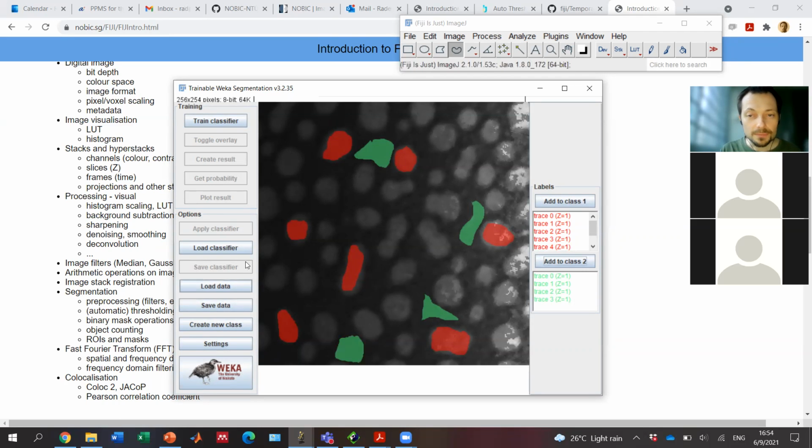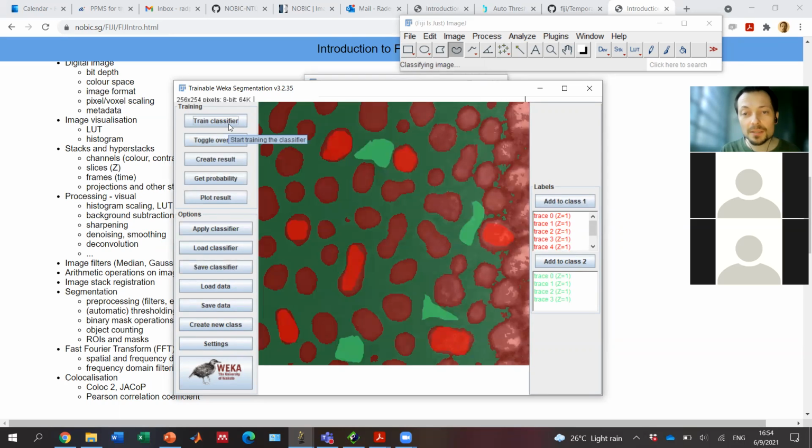Okay, I won't be dragging it out longer. Let's try to train it and see what it does. Obviously, this is not the optimal training, but you see that even with this measly training, where I just segmented manually, not very nicely, I didn't draw the contours so nicely, and I didn't train it on that many regions of interest, it still didn't do that badly. So if I trained it better, if I took the effort, then I might get a good segmentation quality.